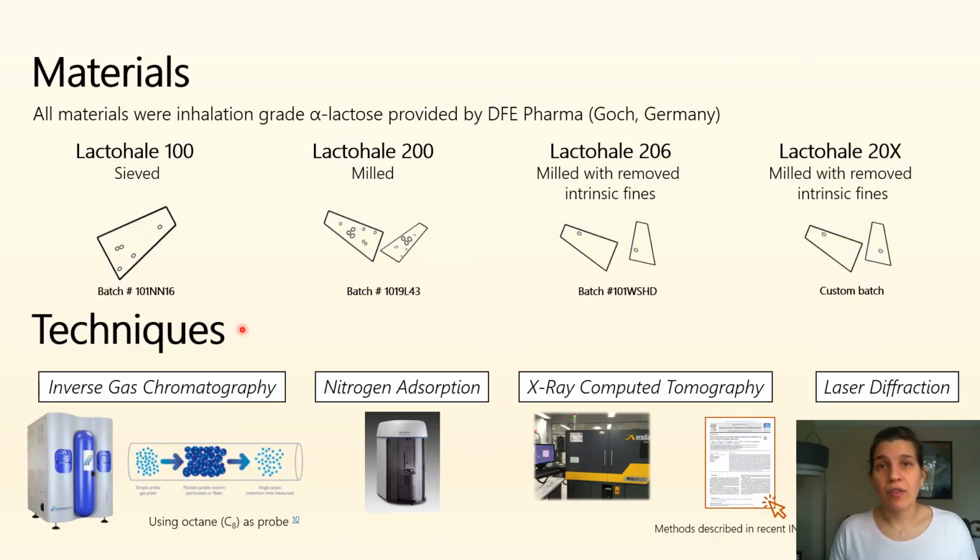The powders that we have used are different grade inhalation powders: alpha lactose monohydrate, sieved, milled, and milled with removed fines. And the techniques that we've used are inverse gas chromatography based on octane adsorption, nitrogen adsorption, which is the standard, and X-ray computed tomography.